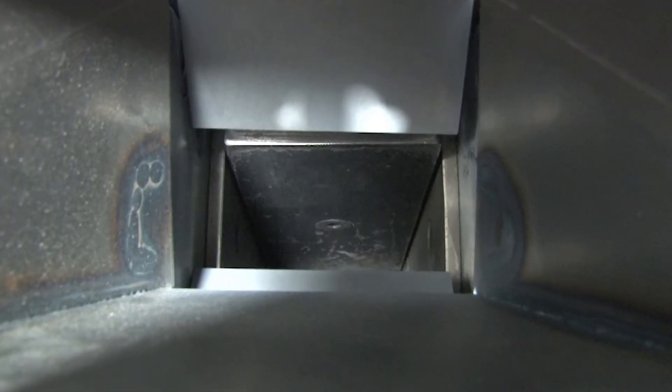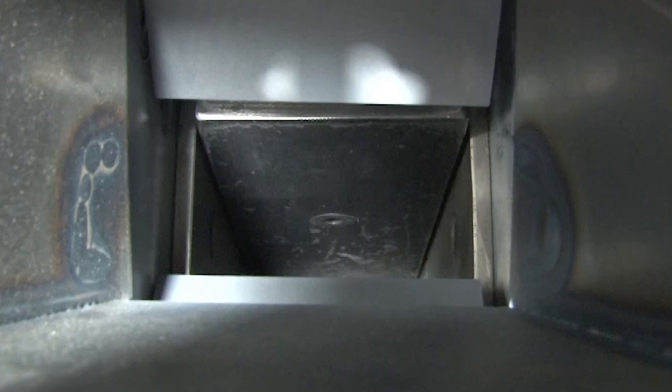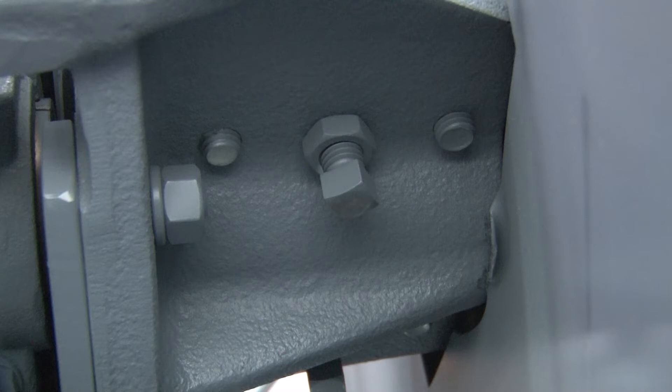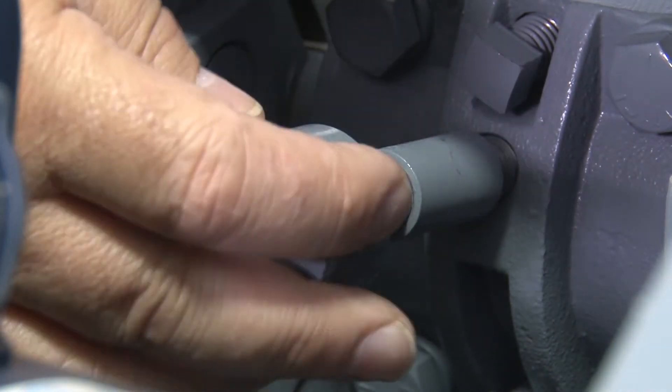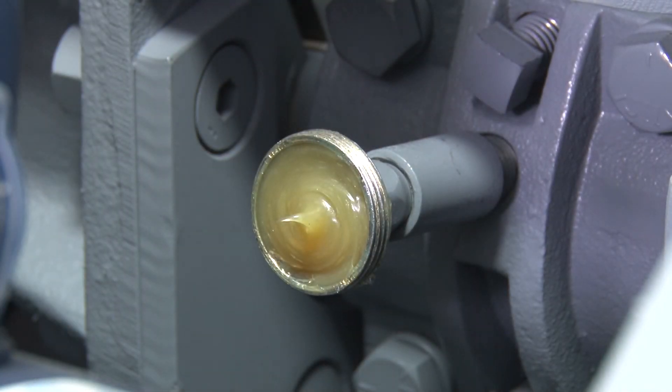Jaw plates are tough, thick steel and are reversible end-for-end for double wear and a long, efficient surface life. Heavy bronze bearings are sealed against dust and dirt and are lubricated by grease cups so that no special greasing tools are required.